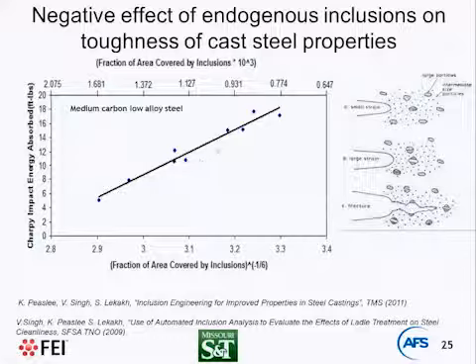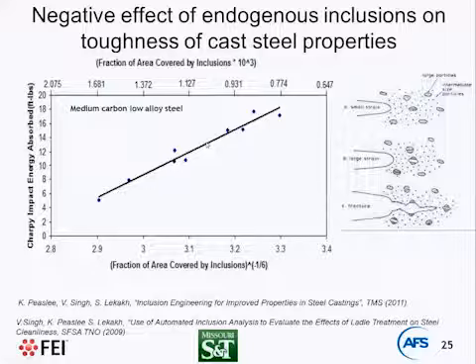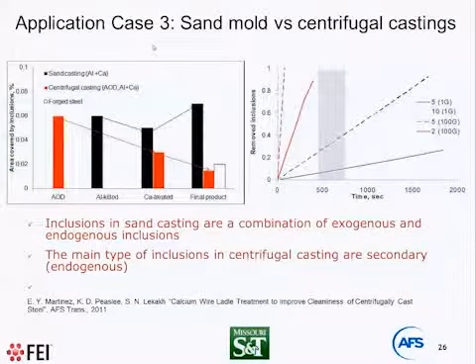And very interestingly, this straight line also follows the theory of fracture toughness, when theoretically discussing crack propagation from inclusion to inclusion, and this trend we definitely observe in the foundry. Whoever is interested could look at our articles. We published this.